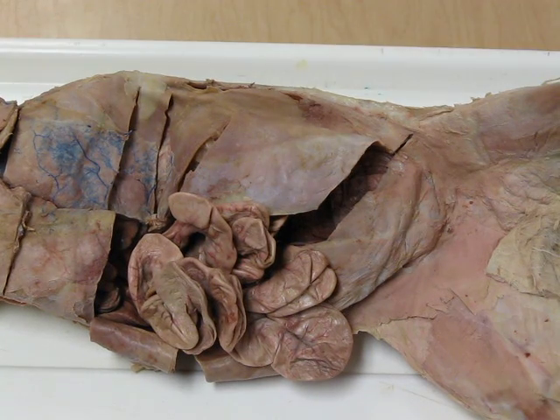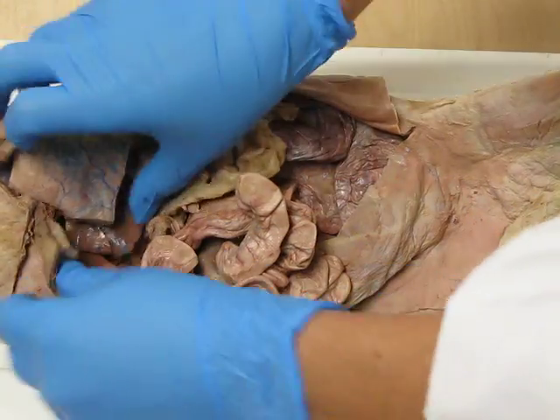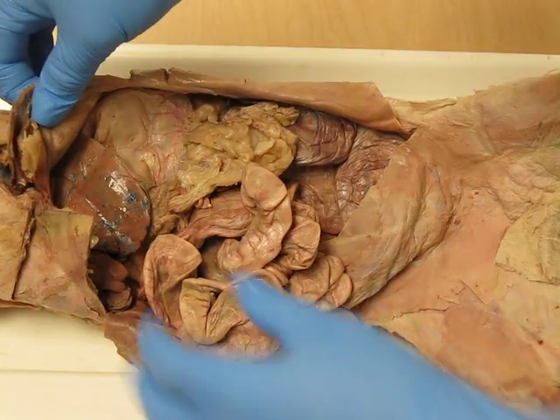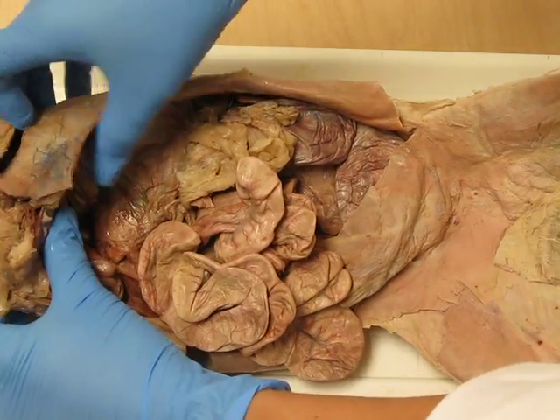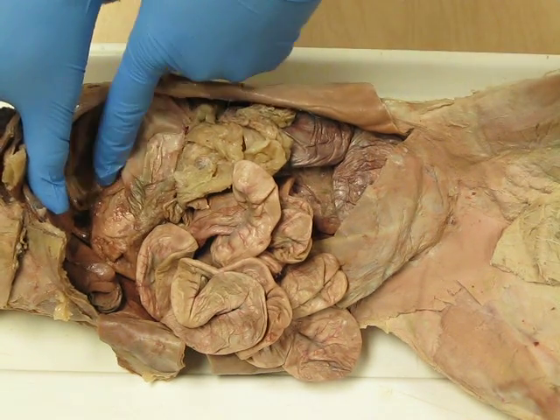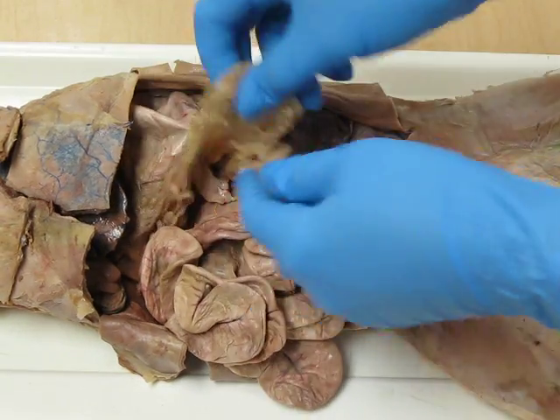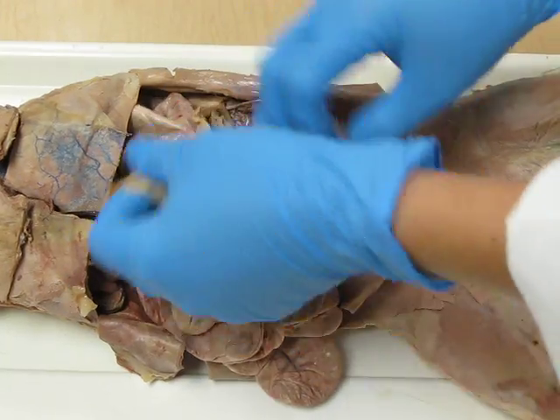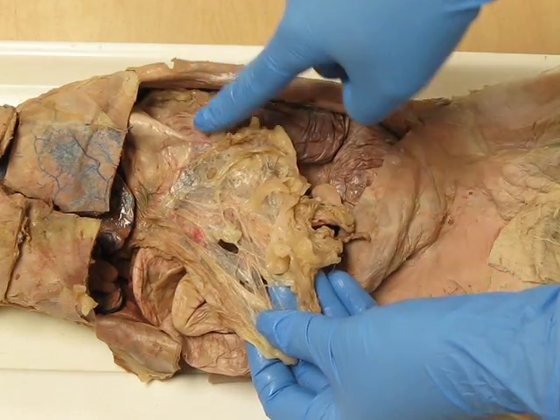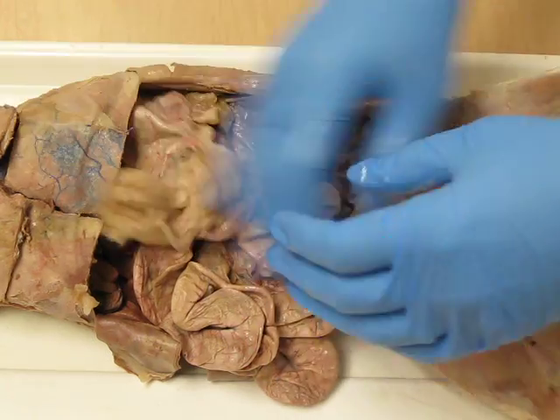Okay, so the remainder of the digestive system where we left off from the head, starting with the lesser omentum. The lesser omentum is between the stomach and the liver. So what you want to do is lift up the liver and look between the stomach and the liver. And this little bit of membrane that is between them is the lesser omentum. Now the greater omentum is this large sheet-like membrane extending from the greater curvature of the stomach. Okay? Greater omentum.